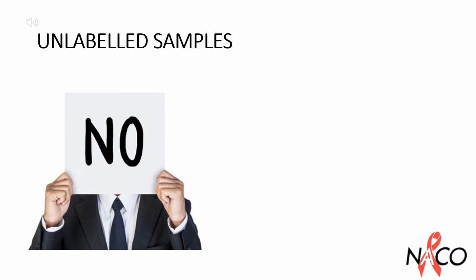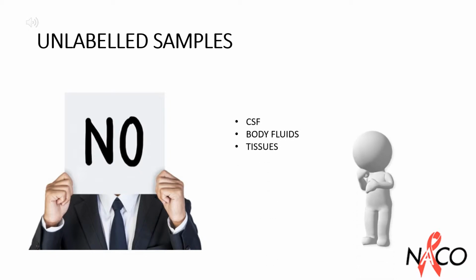Specimens which are less common and more difficult to recollect, like CSF, fluids, tissues, etc., will require the person who collected the specimen to identify it and assume responsibility till it has been identified. If the laboratory still cannot identify the specimen, the clinician who ordered the test should be notified and a repeat specimen should be collected whenever possible.